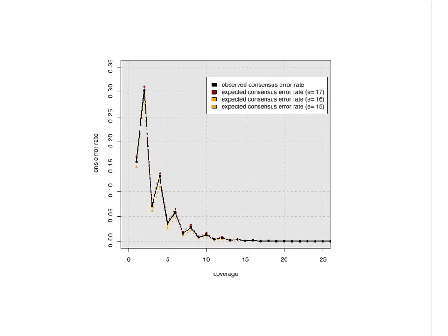So for large genomes and for cases where you need flexibility, that's the other issue. The all-paths assembler requires pair information. So if you just have unpaired Illumina or unpaired 454 or PacBio CCS without pairing information, our method is really the only option for those. If you do have kind of a production setting where you're able to make jumping libraries with Illumina and you're able to make the short jump libraries, and you can combine all of those data types, I would not hesitate to recommend all paths. I think it's very competent. But there's definitely drawbacks to each of the approaches.